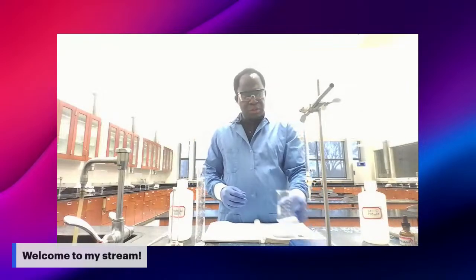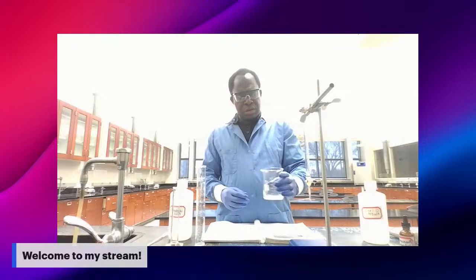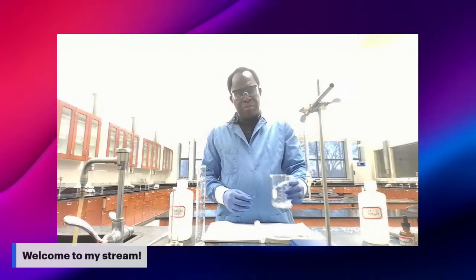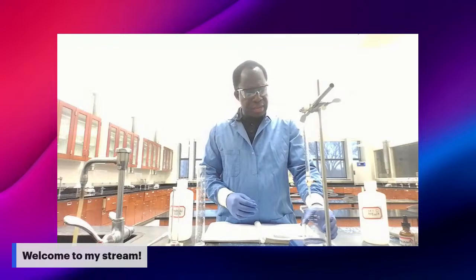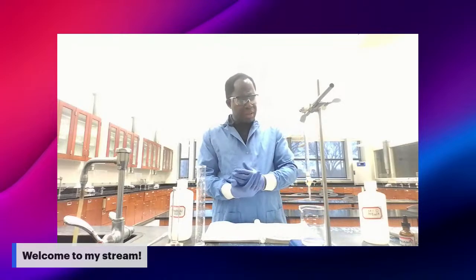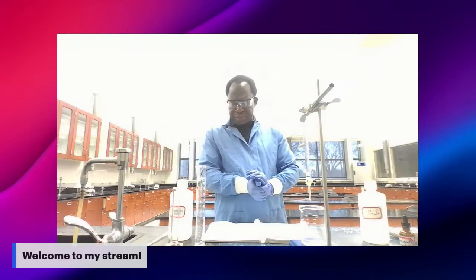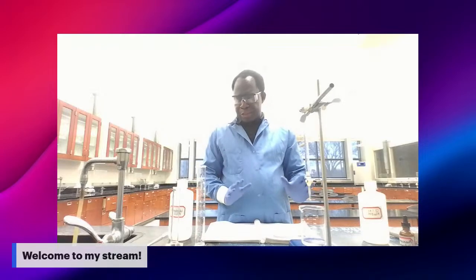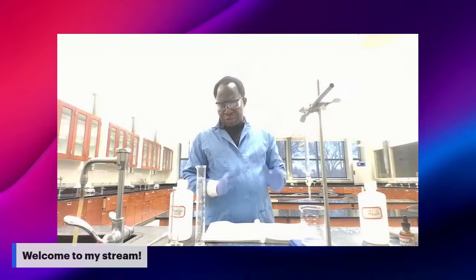Make sure you shake the beaker to mix the acid and the phenolphthalein. So this is part one of the experiment. Now you move to part two.